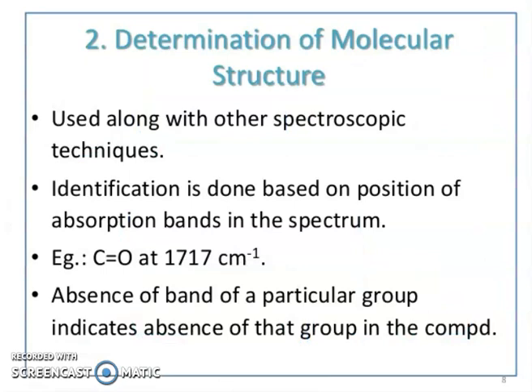Another important application: determination of molecular structure, used along with other spectroscopic techniques. Identification is done based on the position of the absorption band in the spectrum. Absence of a band of a particular group indicates absence of that group in the compound.